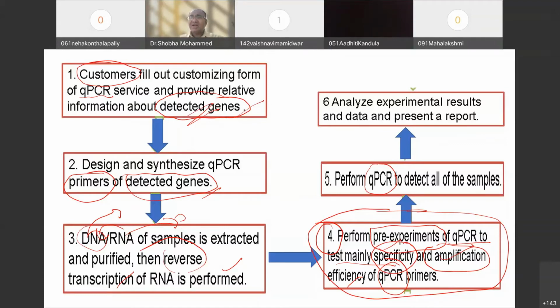So I cannot compromise on the quality control of any instrument. Quality control analysis should be done before I start that particular machine. Any machine we switch off and on, we have to do this quality analysis in laboratory medicine, which is the best growing branch in the medical field nowadays. Did you understand the flow chart I have told you?